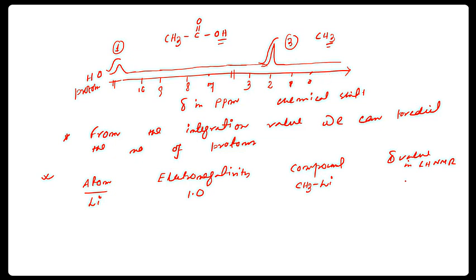Its value is basically minus 1.94. If the proton has a more electron-rich environment, it will shift to the lowest ppm or lower ppm regions. We see this will exist as lithium plus and this is minus, the huge negative environment. That's why the ppm value is minus 1.94.